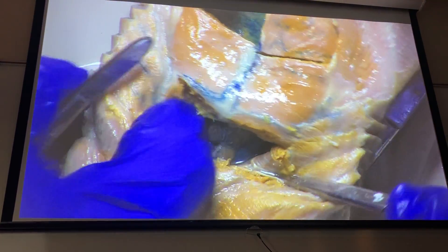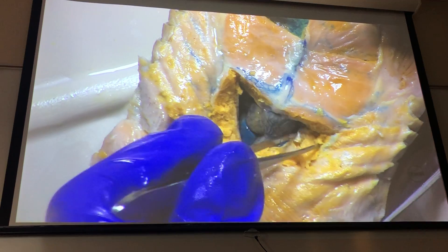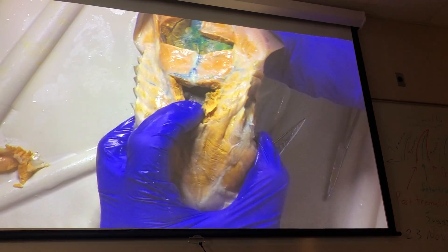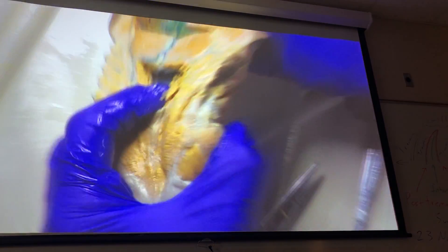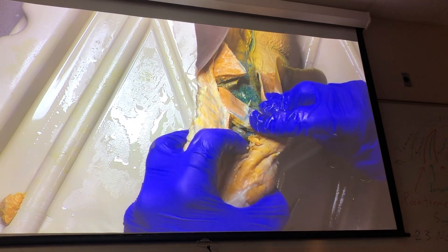The conus arteriosus is in the crotch of the U. On our ventricle we can see blood vessels — those are coronary blood vessels, not too surprising. If you get lucky and get the right angle, lift up on the ventricle, you'll see a light underneath. Right behind the coracoid bar you'll see a blue light which is the sinus venosus.